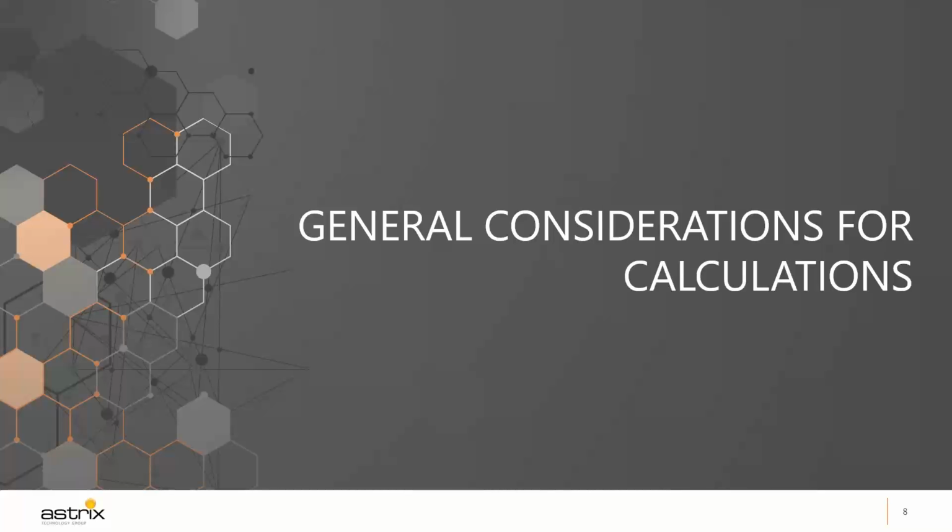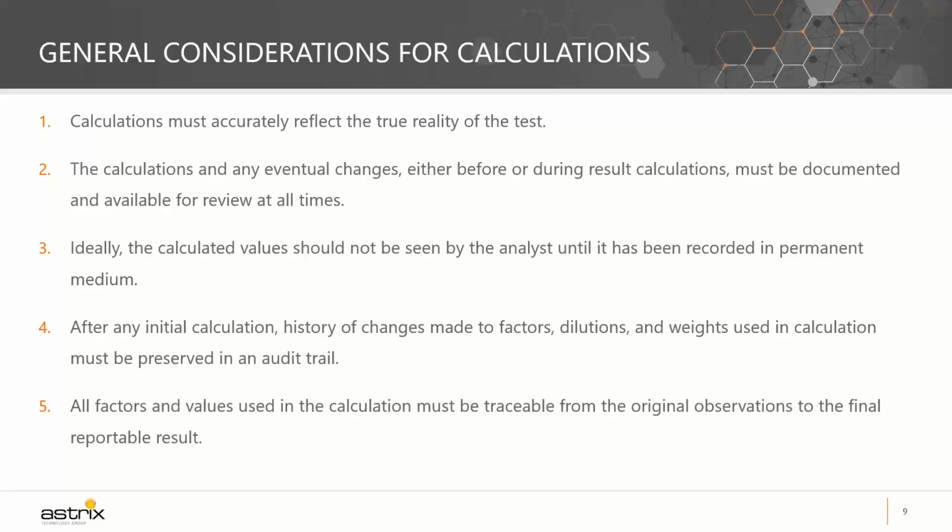So, general considerations for calculations. Having the data integrity concepts in mind, we will discuss how Empower can help you address data integrity concerns associated with human interaction with data, and we'll show you how Empower can deliver calculations in a controlled environment. It's worthwhile to start the discussion by defining the characteristics of calculations to be performed in a robust and compliant manner. 1, the calculations must accurately reflect the true reality of the test.